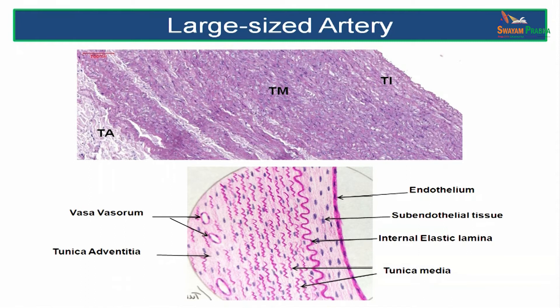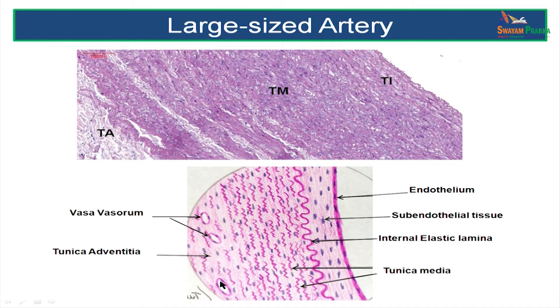In a high power view of the large sized artery, you can see the endothelium and tunica intima, and a very thick tunica media. The tunica media has more elastic fibres and less smooth muscle fibres, so a prominent internal elastic lamina is not seen. The diagram shows the endothelium on a basal lamina, subendothelial connective tissue, a less prominent internal elastic lamina, a lot of elastic fibres in the tunica media along with smooth muscle cells, and a much thinner tunica adventitia. Note the vasa vasorum in the tunica adventitia.